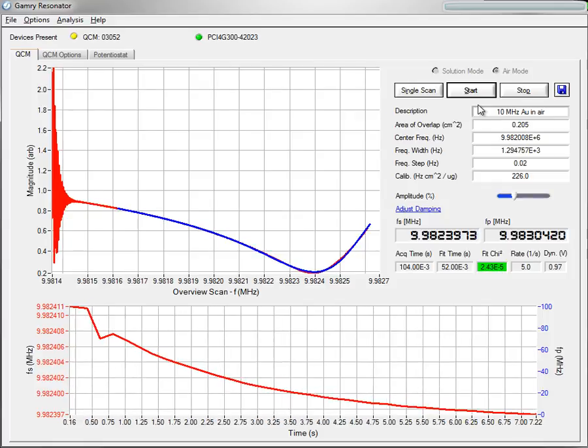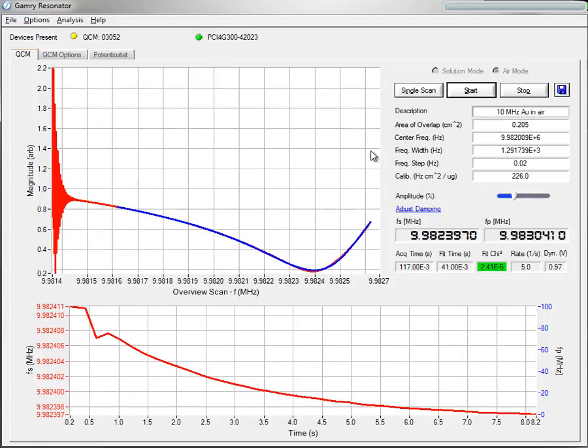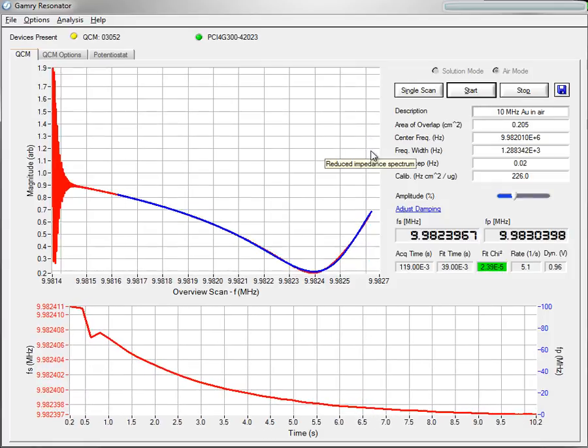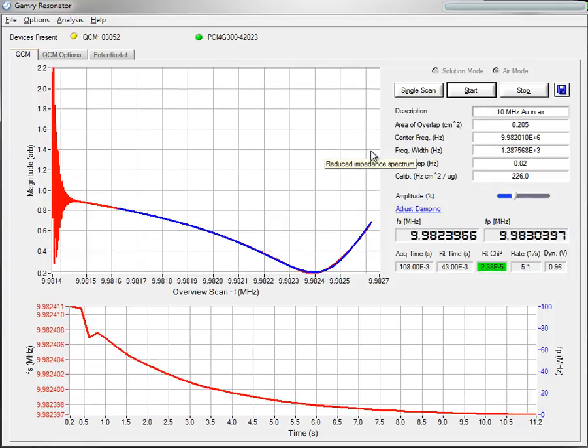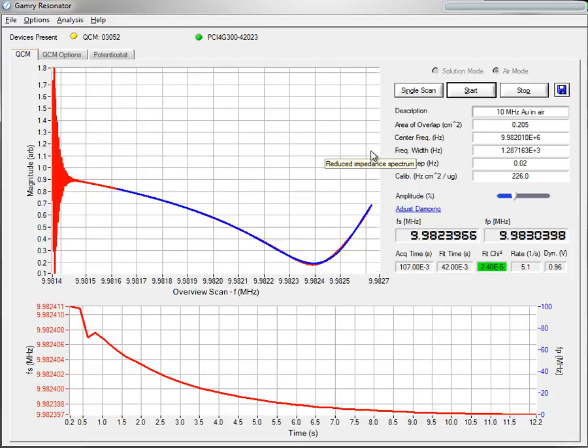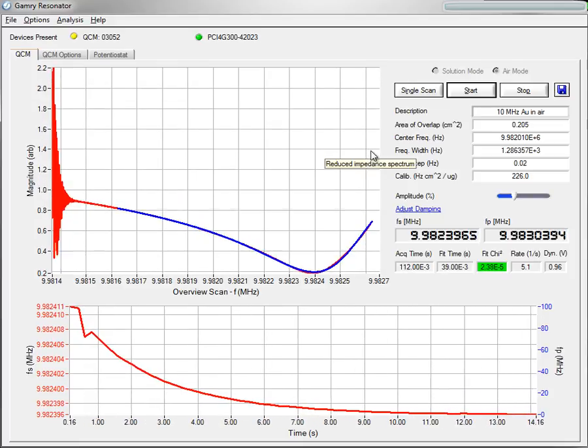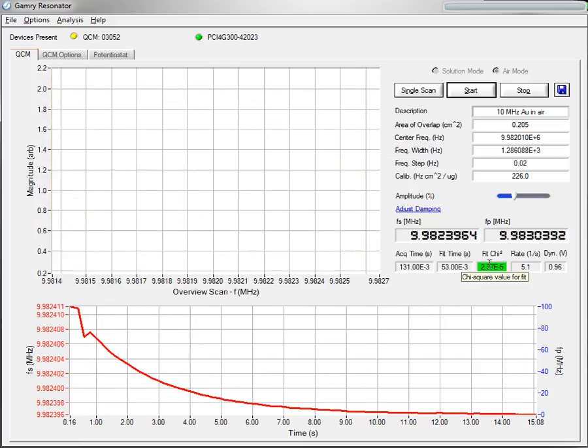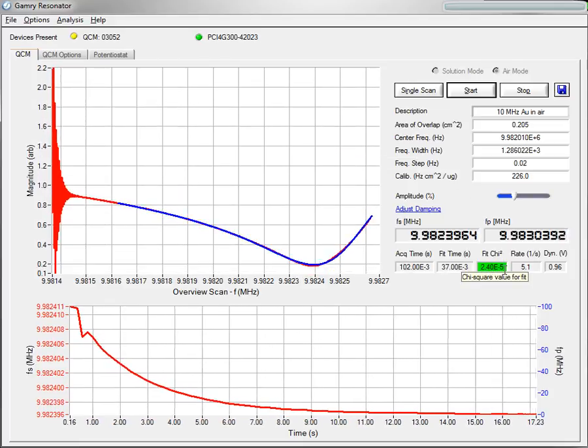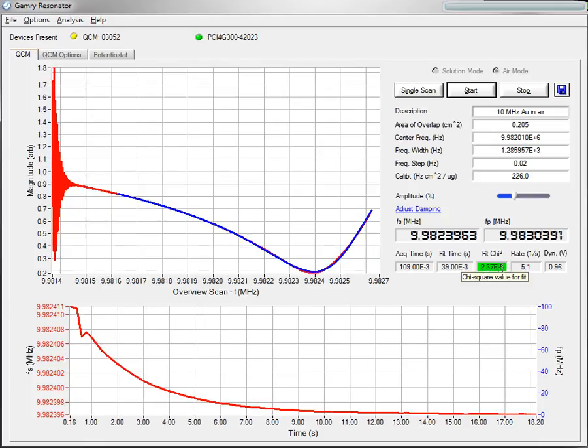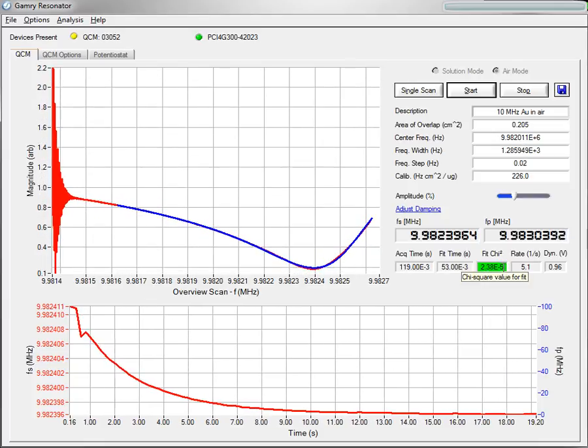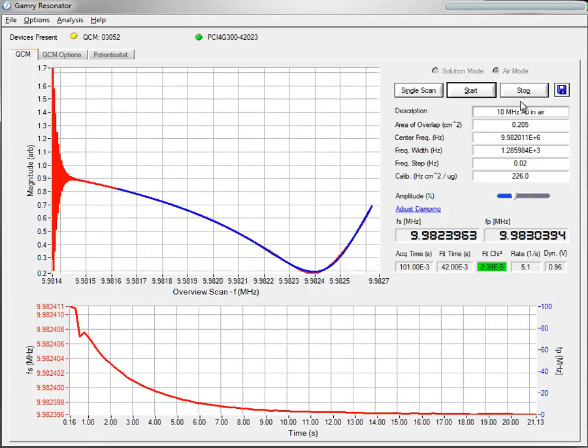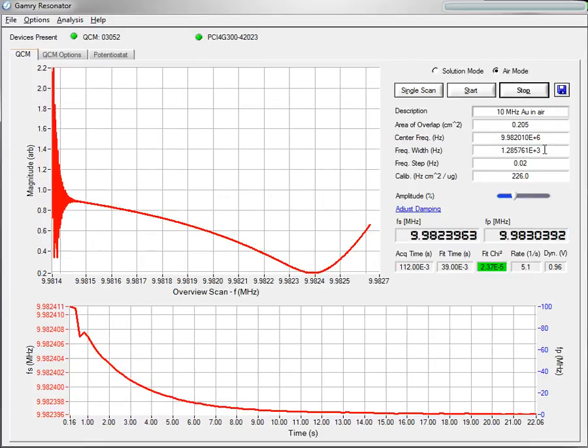So now we can see that with some adjustment, we're able to get good continuous acquisition here. You know, our fit chi-squared has gone green. We're at 2 times 10 to the minus 5. That can probably be improved a little bit.